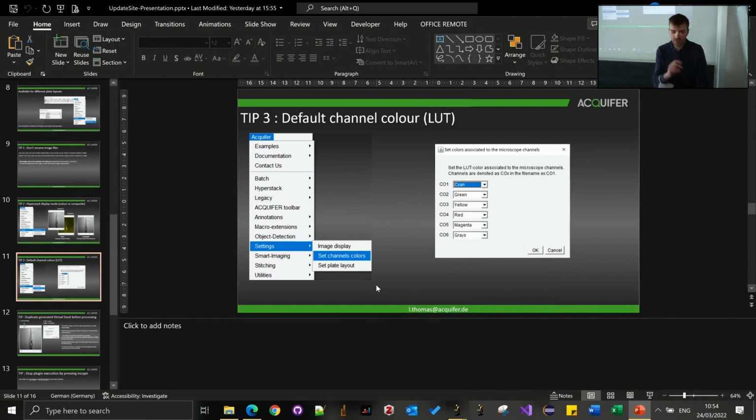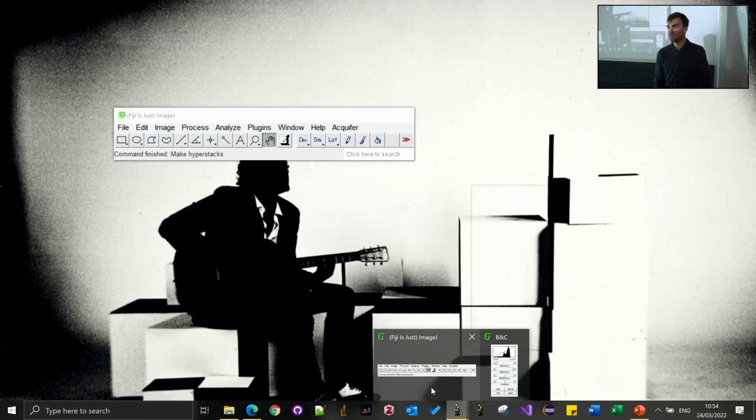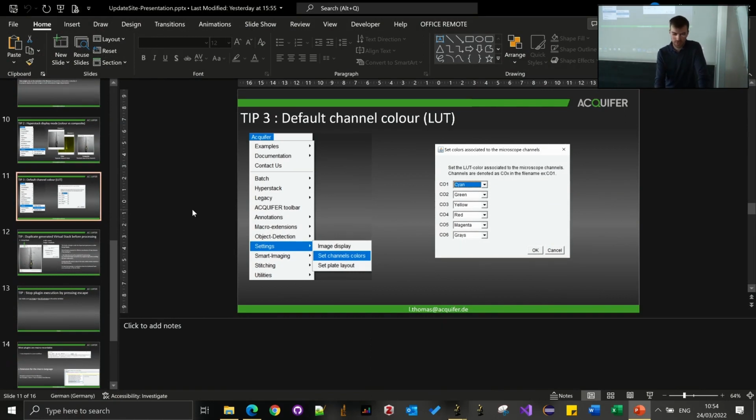And so I could have like a tick box add scale bar. Yeah. It's just I'm trying to keep the number of parameters low because the graphical interface is kind of crowded already. And the scale bar is not something you do for a figure, but in an analysis and stuff, it's not like, yeah. So I will check for this cropping use case, why it's not happening.